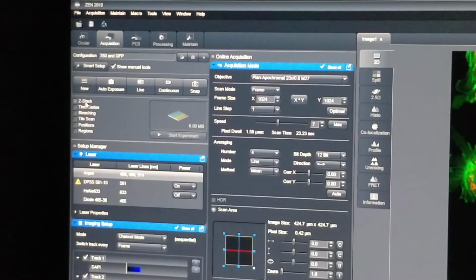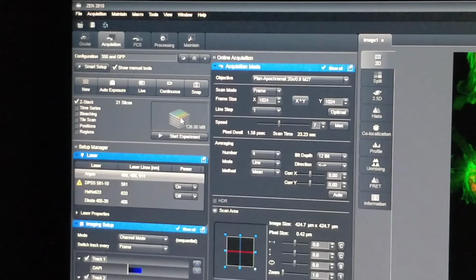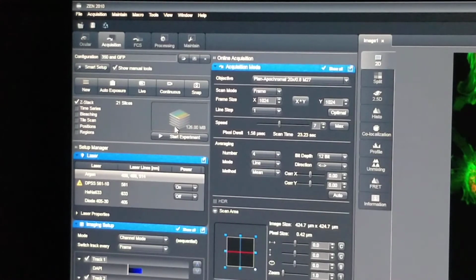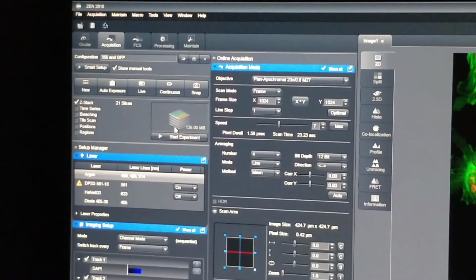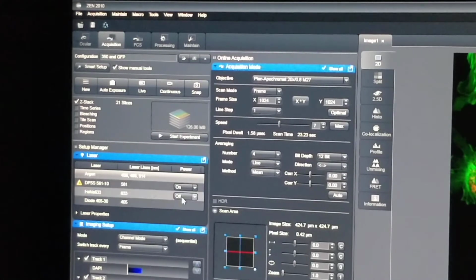Okay, what Z-stack is, this basically means we're imaging the same XY position but at different Z positions, and you're imaging it kind of like a 3D printer, layer by layer, so that way you get a 3D image and you can acquire the relative Z information.